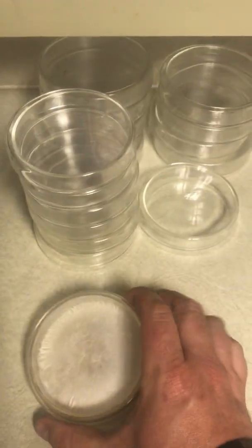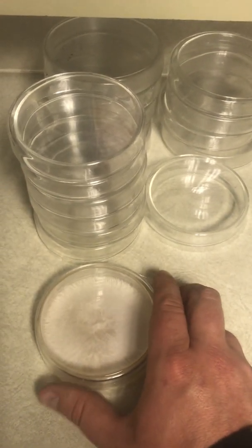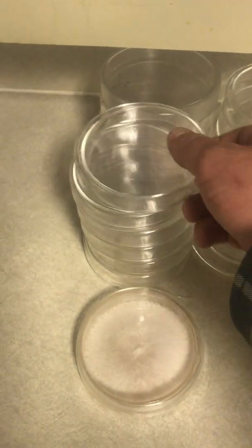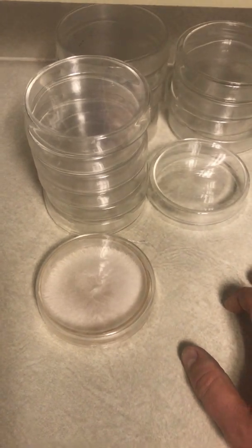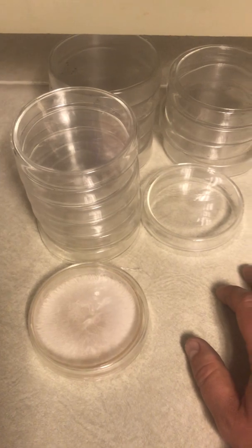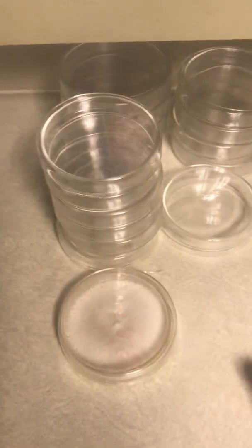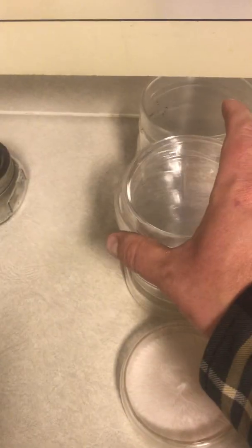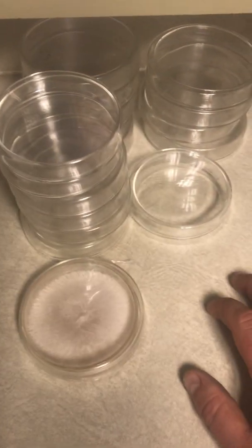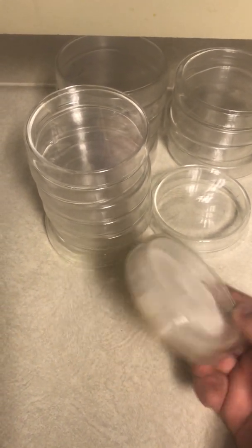Now I want to talk about my favorite containers, which are these glass Petri dishes. I've been able to find these for about $2 a piece. There are some Pyrex ones that look nice but are very expensive — if you look on Amazon you can find glass Petri dishes for between $1 and $2 each, and these are my go-to now. They're reusable, you can put them in the pressure cooker with no problems. The plastic version exists too, but you can't pressure cook those and have to throw them away after every use, so I moved to glass to avoid wasting so much plastic. Here's an older transfer I made just to show that I am growing mushrooms in them.